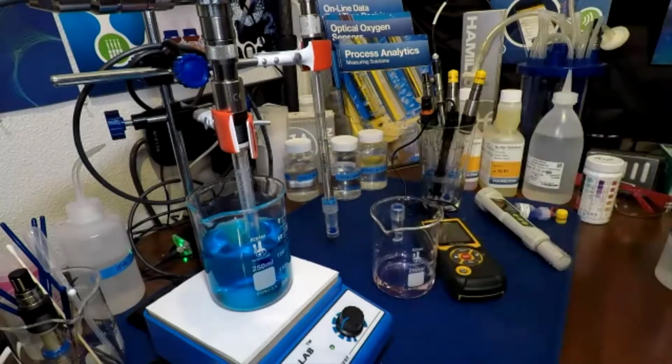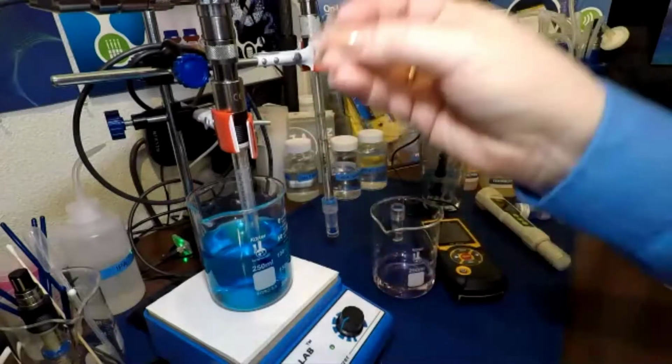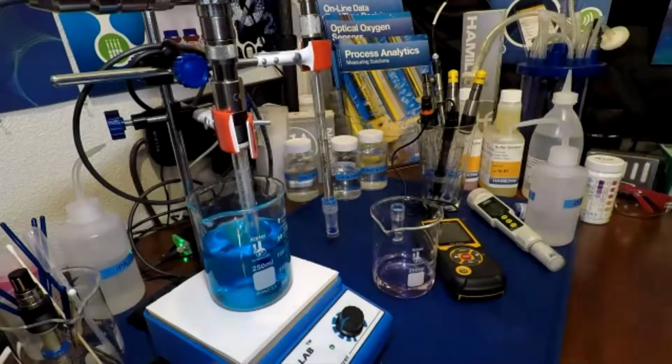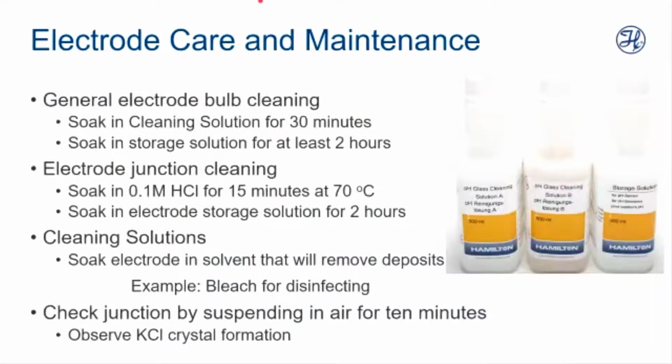Anyhow, you're stirring. If you're going to move from one to the other, again, as you move up, you lift your sensor up, you rinse it with DI water, you blot at the end, you move into your next location. These are all important things.